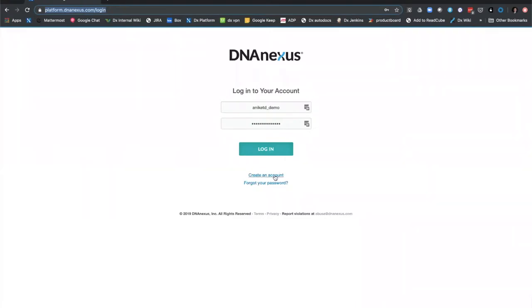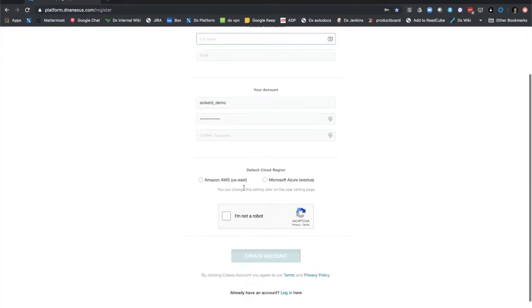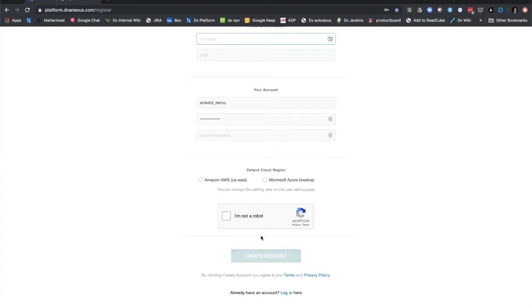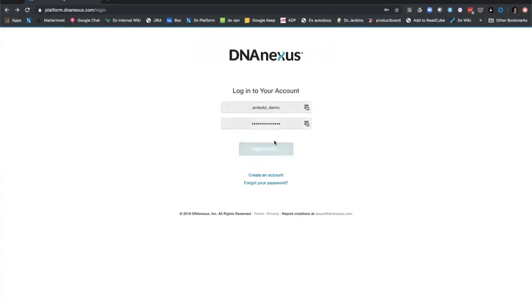You can go ahead and create an account, pulling in your personal information and account information, and choose a default cloud region. As you may know, DNA Nexus is multi-region, multi-cloud, giving you the flexibility of choosing your underlying cloud region while maintaining the same look and feel across multiple regions. Since I already have an account, let's just go ahead and log in.